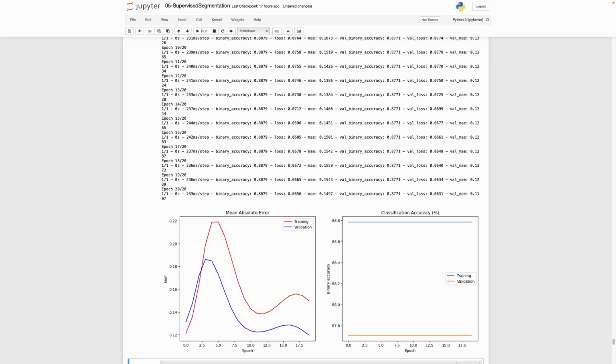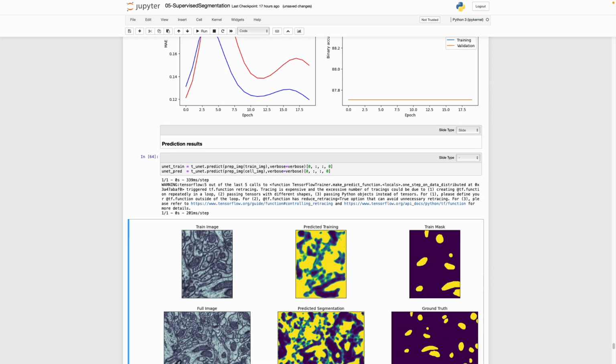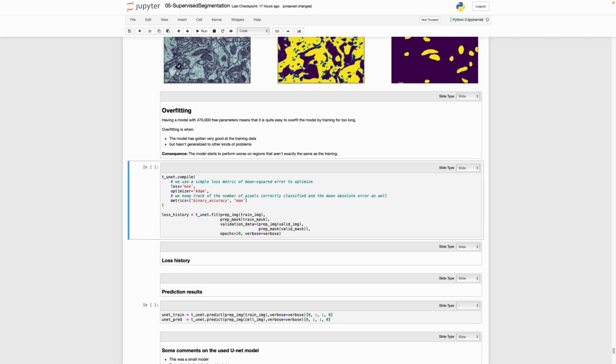So then here is something strange going on. Yeah, now I think I'm a bit saturating my laptop. Yeah, then everything starts turning into the same class, so maybe not the best.